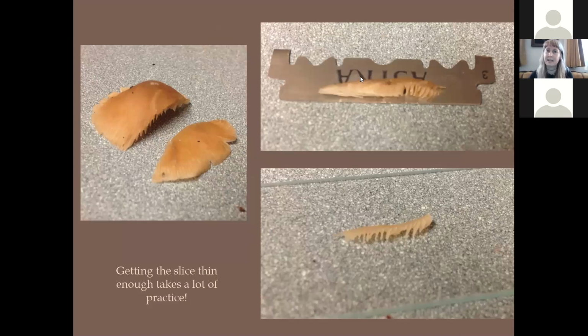I have to say that these sections here are not going to be thin enough. You do need a thinner section than that, or there's just going to be too much fungal tissue, too many cells sitting on top of each other to see things very well. It takes a lot of practice. I did learn a new technique recently that I think is going to work pretty well. And I put it in my Instagram stories today if anyone wants to look at it. And I also am keeping it in the stories under microscopy in the highlights.